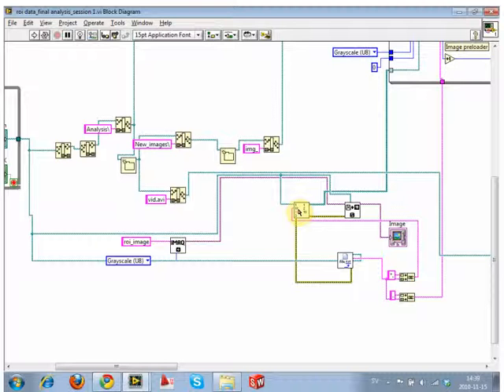But we're programmatically writing that. We're saying if you chose bitmap files, this filter is bitmap. If you chose TIFF files, this filter is TIFF. If you chose JPEG files, this filter is JPEG. It's reading the file extension for the file you chose and using that as the filter. So if you click on this VI file and not on the JPEG file, it will read just VIs. Okay, I get it. If you clicked on the LEI, then it would just look at LEIs. We are selecting because of one file and that's it.